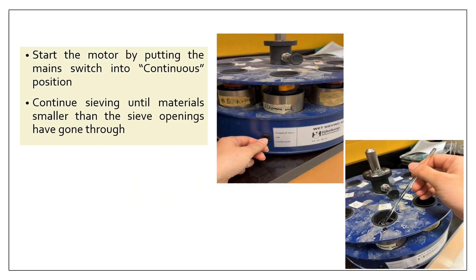After placing the cans, start the motor by putting the main switch into the continuous position as shown in the picture and let the motor keep running until only sand particles are left on the sieve. But if some aggregates remain stable after 5-8 minutes of sieving, turn off the motor and drop them with the rubber-tipped rod until they are disintegrated as shown in this figure. Continue sieving until all the materials smaller than the screen opening have gone through.